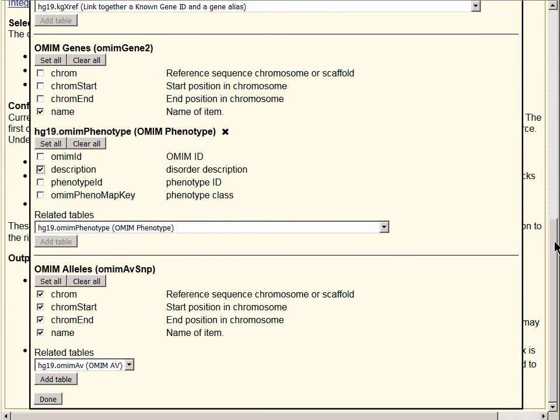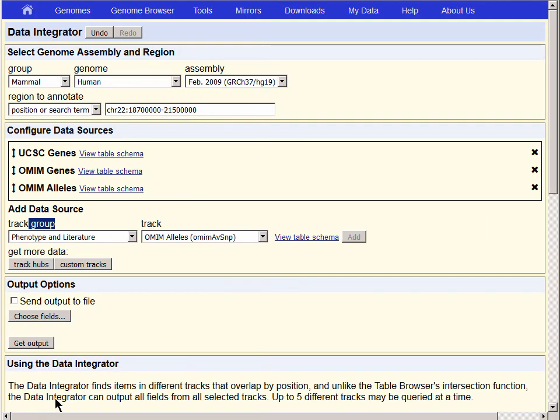And then for the OMIM Alleles table, let's just get the Chrome Start, as these are typically single nucleotide alleles, and Chrome End will be obvious, and we'll get the name. Finally, the Done button at the bottom takes us back to the main page, and we're ready to get our output.